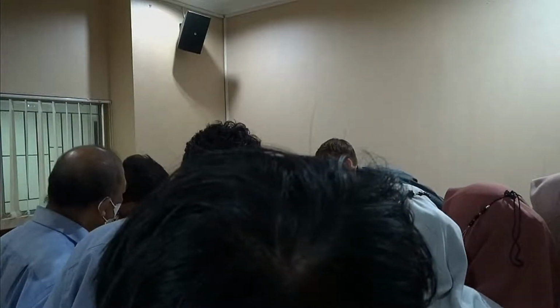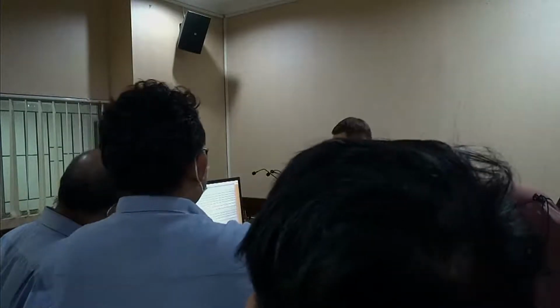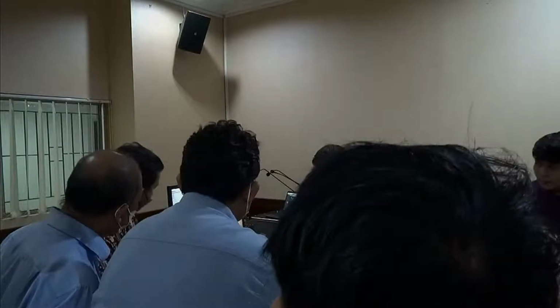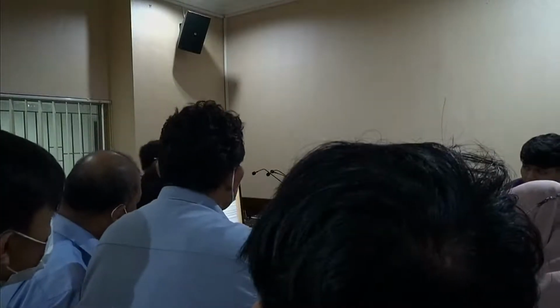So what do we need to do to fill it? We need to click New Measurement, and now we can select an SOP. So you can, of course, manufacture or write your own SOPs for different materials and so on. The way the SOPs work, they are a set of commands. So you can program them very freely. In the software, you'll find certain commands, and you can just add them to one another, and that way make your own procedure.